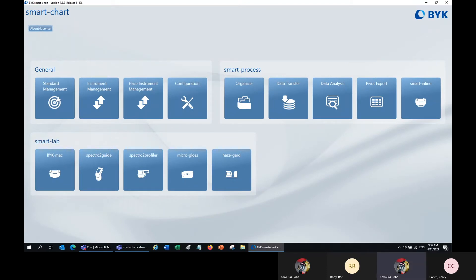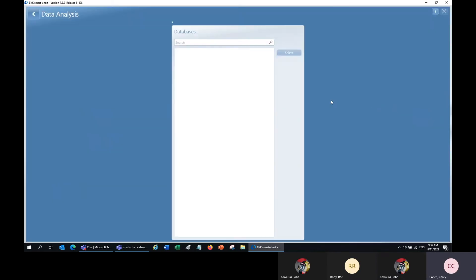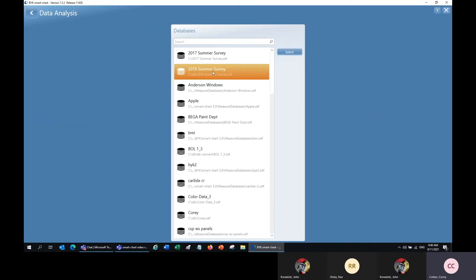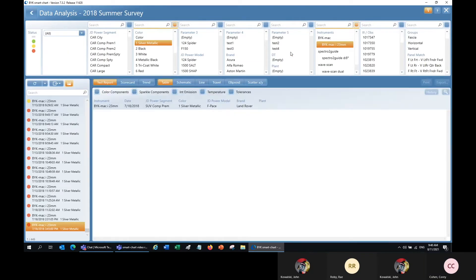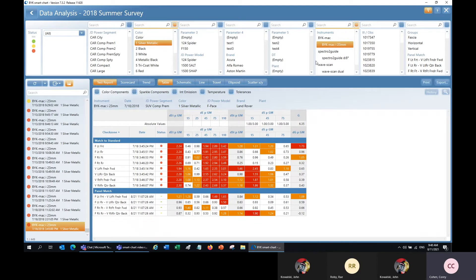Hello. Today we're talking about data analysis for the BIC-MAC-I. From the main menu, I will enter the data analysis section and select the database I want to view my data from. Now I have these filters at the top to select for the data I want to see, and from the list on the left, I can select the test series I want to see.